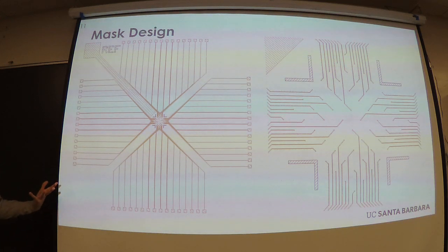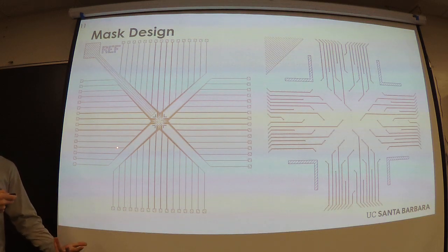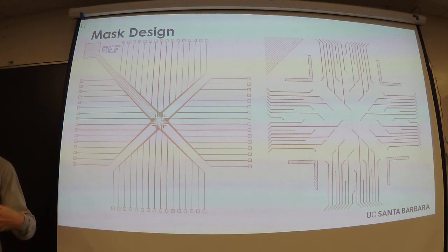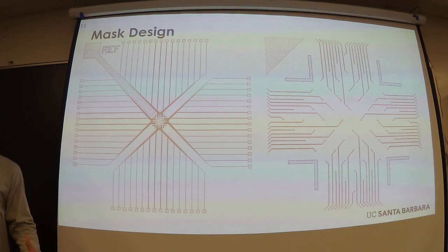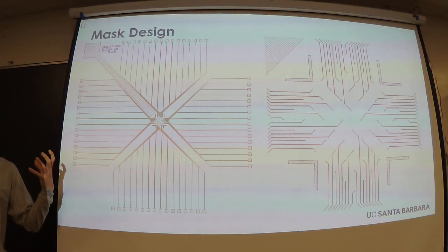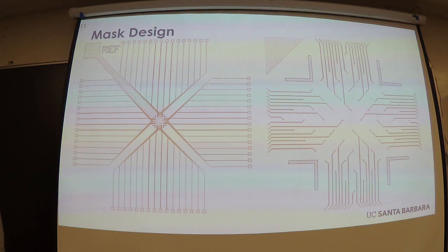So this is the mask design that I made, and this is the shape of the electrodes that we want to have at the end. You can see there's this reference electrode for making your voltage measurements. There are bond pads, which will be used later when we put this into some sort of electronics. This will allow us to make a bridge between the electronics and the wafer itself. And of course, the blown up area over here is the sensing area where all of the electrodes themselves are. The electrodes are 10 microns in diameter, and each of these electrodes in the center corresponds to one bond pad out here.